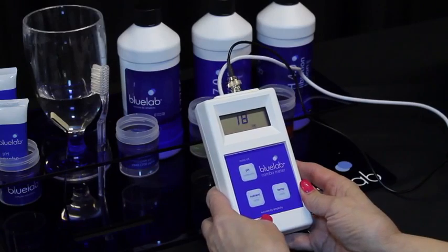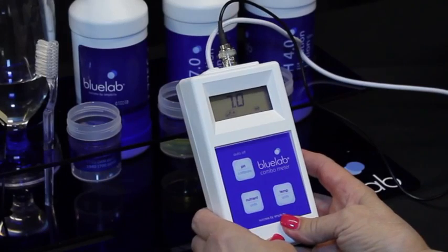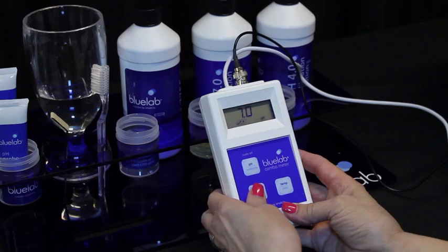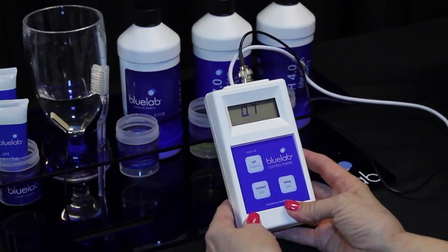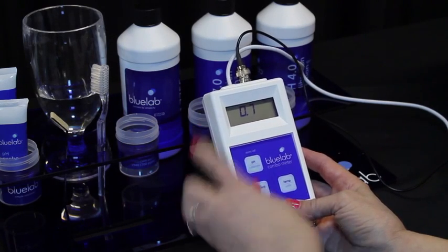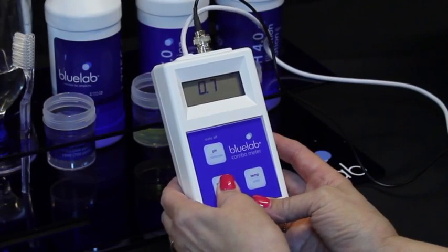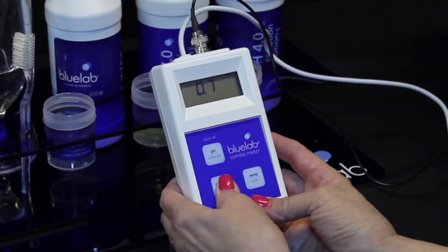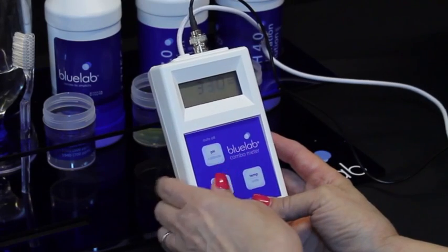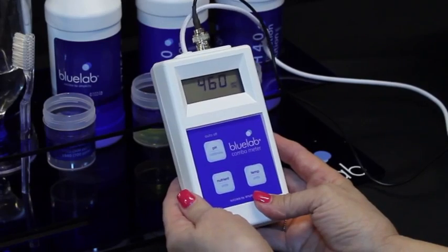To obtain a pH reading, press the pH calibrate button to select pH and wait until the reading on the screen stops moving — it may take a few minutes. Press the nutrient button to take an EC or ppm reading; wait until the reading stops moving, which may take a few seconds or a few minutes depending on solution temperature. To change the conductivity units, press and hold the nutrient/units button until the display starts flashing, then short press the same button to scroll through available units and stop pressing when the required unit is displayed.